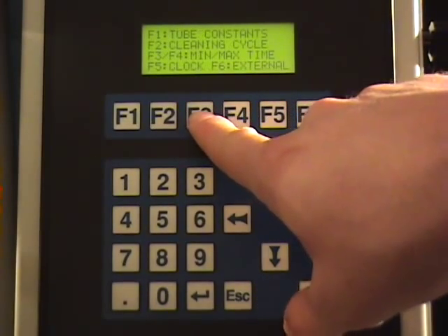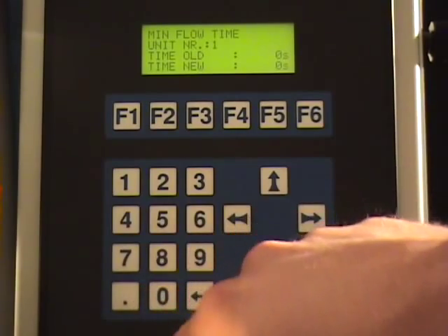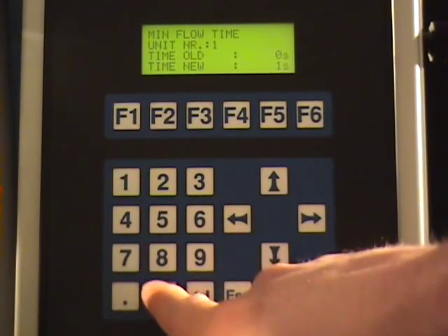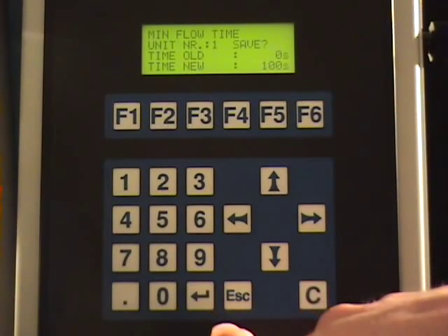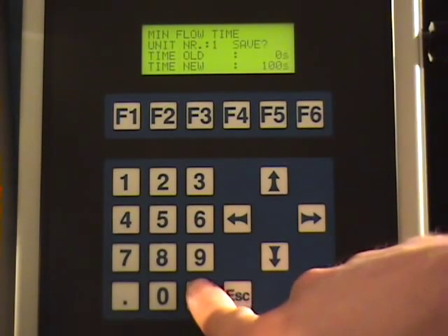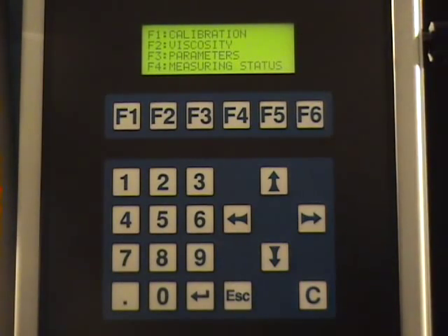Pressing F3 from the parameters menu allows you to specify the minimum time you wish to allow for a measurement. For instance, if you only wish to validate measurements which are longer than 100 seconds, enter 100 and press enter. Any measurement under 100 seconds will result in an invalid measurement and will not be taken into account when calculating the average results.